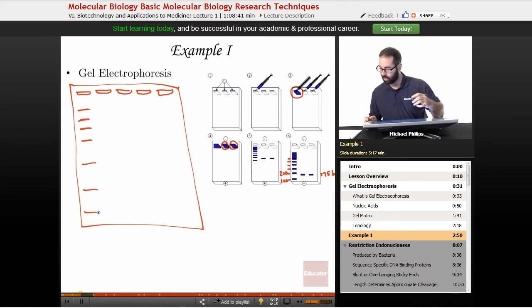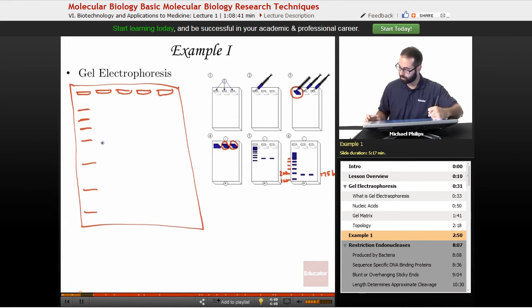Well 2, let's say we have something that's right around here. Well 3, and then maybe we even have something like this. Well 4, we have something here, maybe something here, maybe something here.